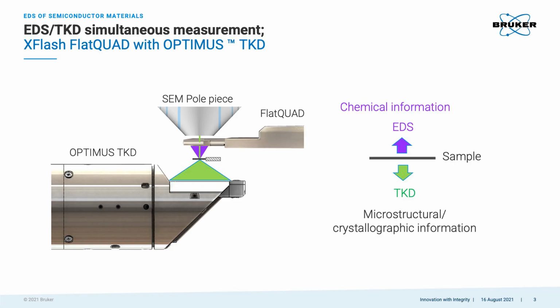It's not as big and not as expensive as a TEM, so it should be used more for evaluating TEM samples. Also, when doing FIB, one can delayer or remove parts of a semiconductor device or structure or wafer, and then look at the different levels which have been set free to check how the element distribution is there. And then we can go bigger. We can also have a bulk specimen in SEM and then look at length scales like several tens or hundreds of nanometers, micrometers. Since I'm coming from TEM, I'm not sure I will be able to cover all, but I know failure analysis of devices, device parts, wafer parts, or full wafers is being done with EDS on SEM.